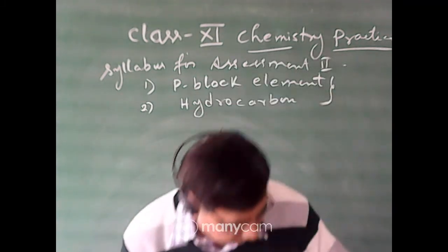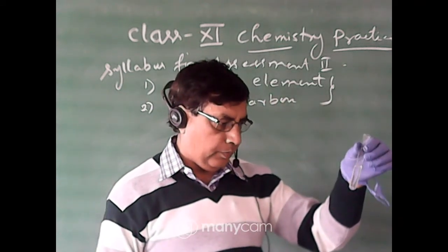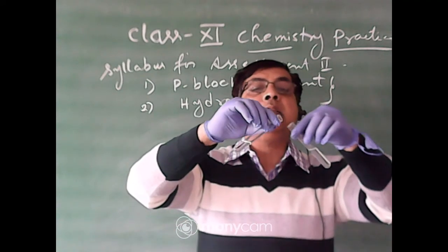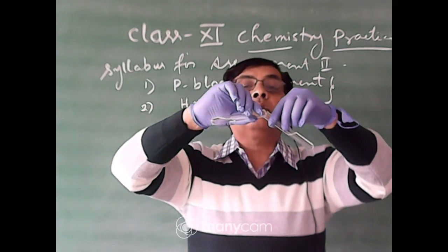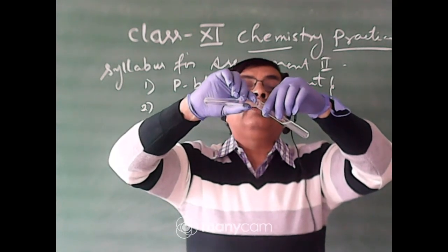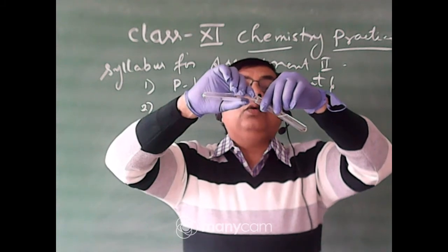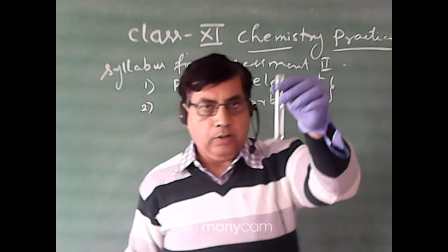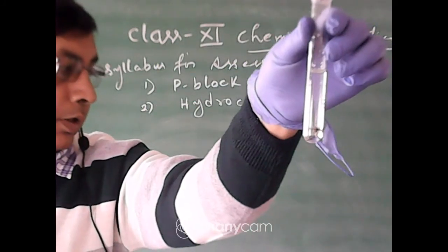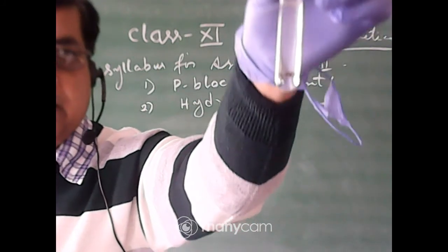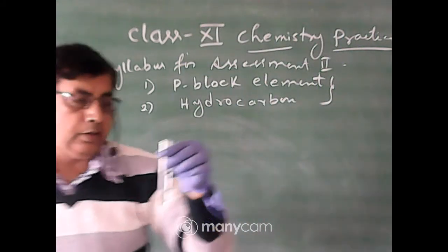This is the original solution with freshly prepared ferrous sulfate. Add concentrated sulfuric acid slowly from the walls of the test tube — do not shake the test tube. You observe a brown ring is formed at the junction of the two liquids. That means nitrate is present.